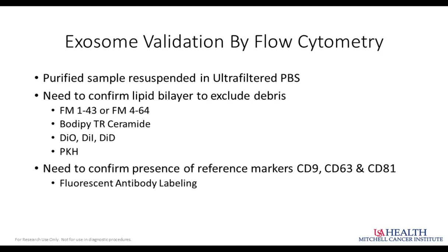There's other lipophilic dyes you can use. Bodipy TR ceramide is actually just a lipid molecule with a fluorescent tag bound onto it that will also intercalate into the outer membrane of the vesicle.